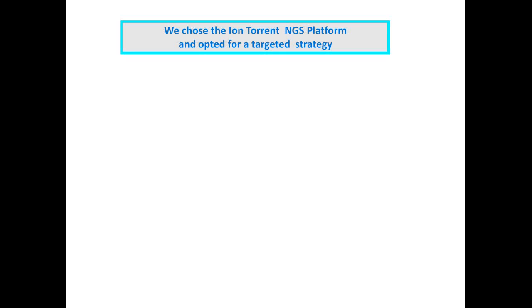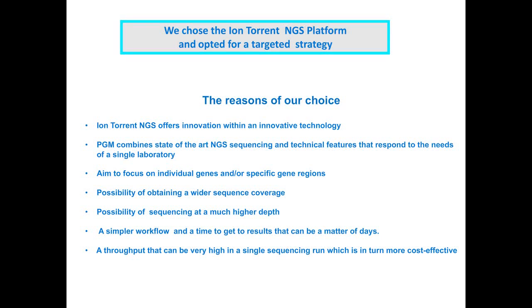So in our setting, we opted for a targeted strategy. We chose the Ion Torrent NGS platform. Why did we make this choice? What are the reasons for our choice?